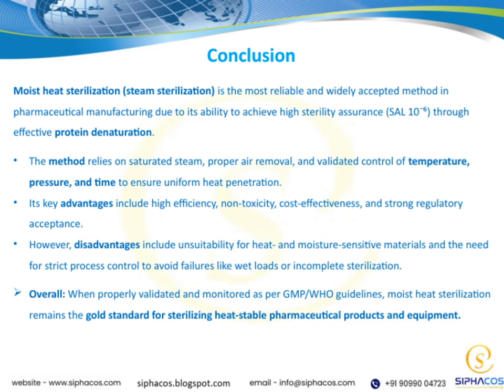Overall, when validated and monitored correctly, according to GMP and WHO guidelines, moist heat sterilization remains the gold standard for sterilizing heat-stable pharmaceutical products and equipment. It's a cornerstone of our sterilization practices because of its proven reliability and effectiveness.